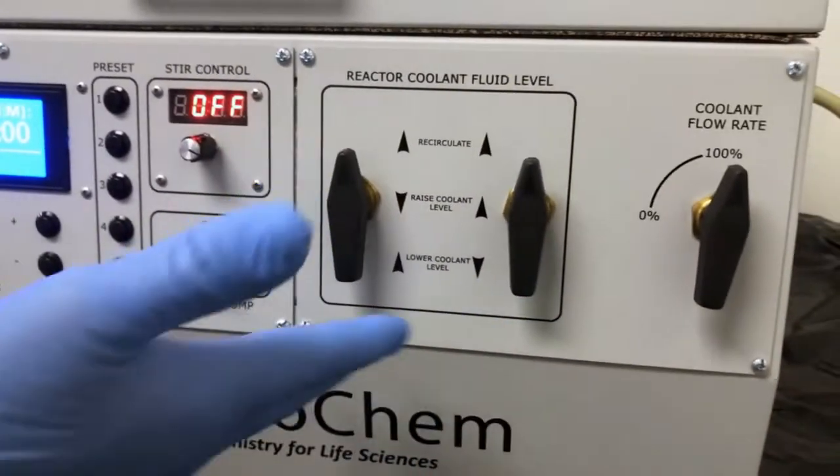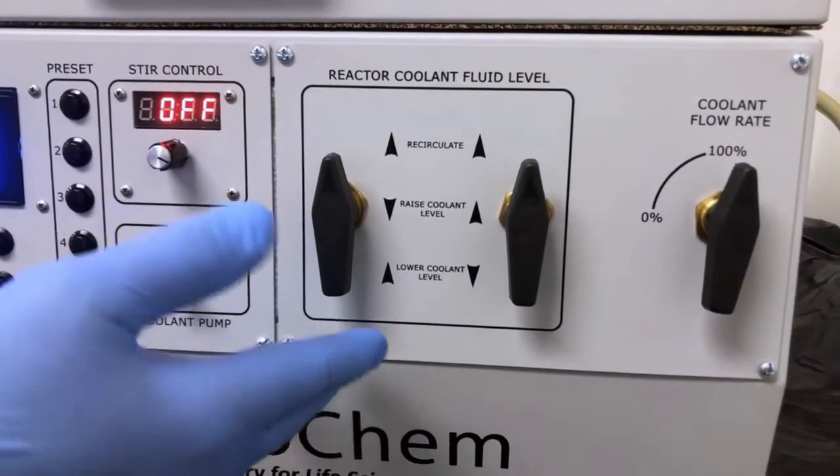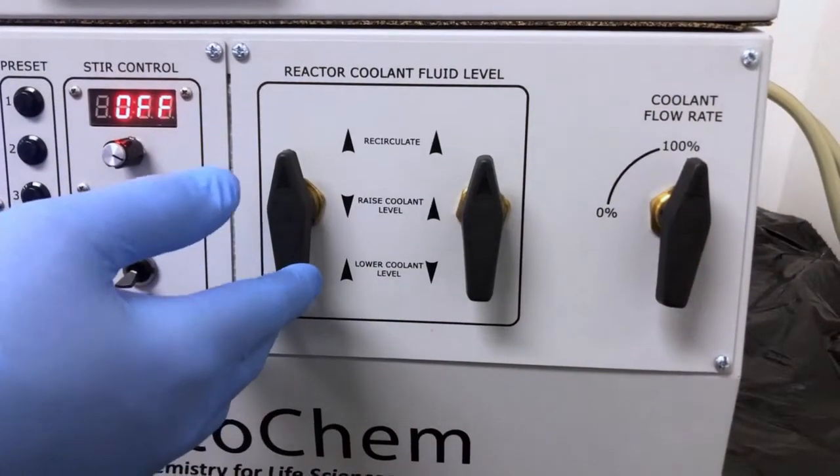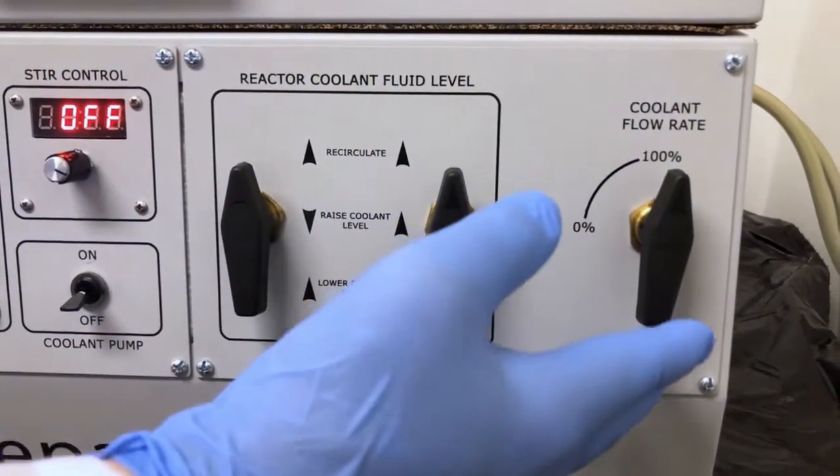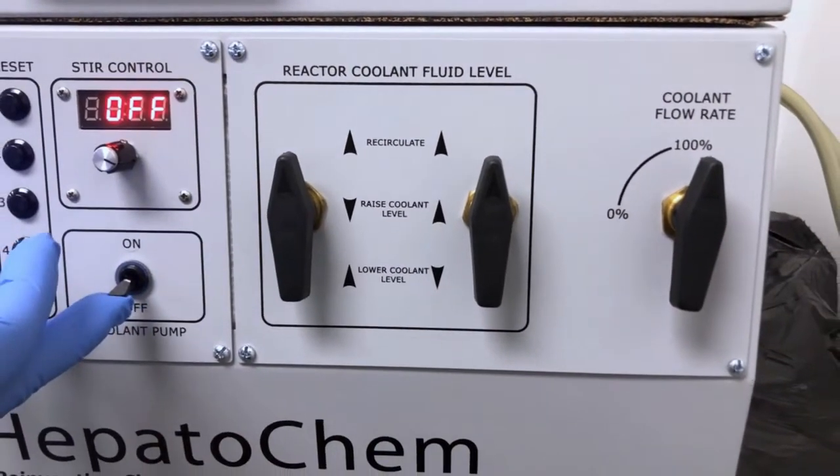The right side of the panel is dedicated to the operation of the Lucent 360's integrated temperature control system. The reaction coolant valves enable precise control over the fluid circulating through the reaction chamber with a separate lever to control the flow rate.